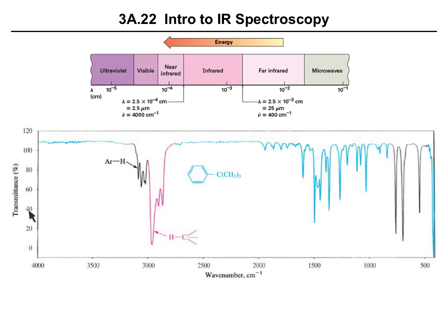First of all, notice that we're looking at percent transmittance over here. If there is high transmittance, that means that the infrared radiation is not being absorbed by the molecule, and instead it reaches the detector. Where we have dips, this is where the molecule absorbs that particular energy of the infrared radiation, causing a bond vibration to happen. Even though these are dips, we can still call them peaks.